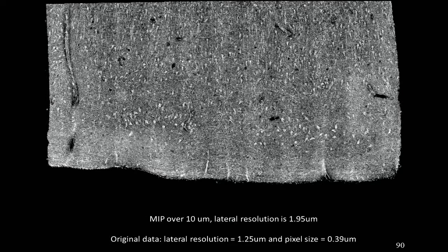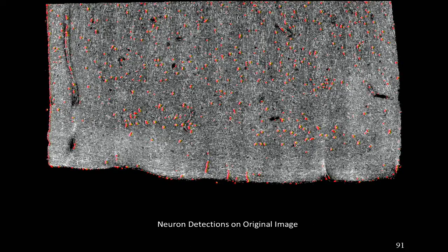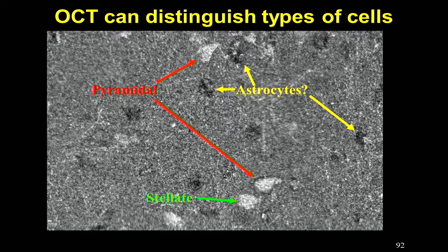And then finally, we've been looking at building automated procedures, because now we're able to acquire volumes of tissue that are undistorted, that show individual neurons. And so this is Ender Kunikulu's work. This is entorhinal cortex, I should say. So this is layer 2. These are the layer 2 islands. And so we're building tools that enable us to do actual counting of neurons over large, extensive tissue.